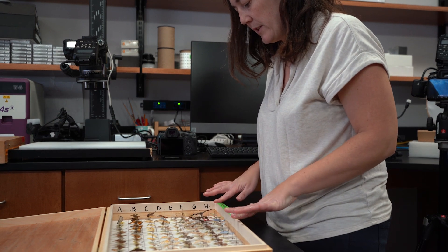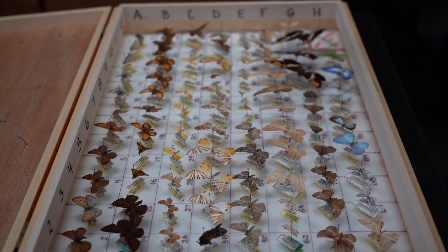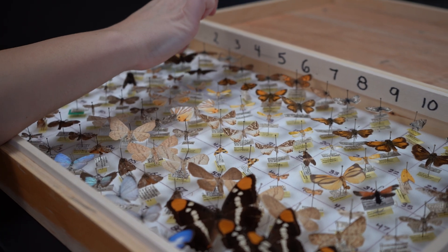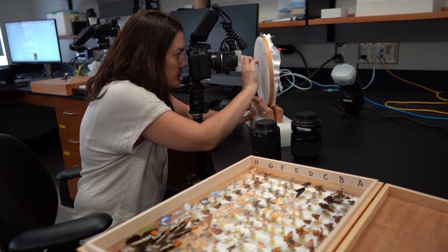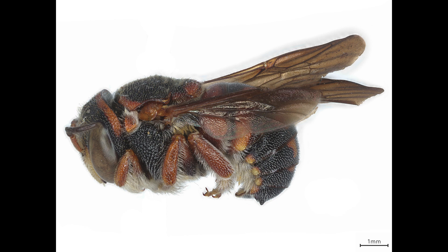Step 5, photographing the specimen. First, take an image of the array box number as a placeholder. Second, take a picture of the whole array box. This image is a reference to use after the container is disassembled. Make sure the label with the box's array number is in the image. Third, when you start imaging the specimens, always start with well A01 and go in array order. Fourth, decide the best orientation for the specimen — dorsal or lateral view. For specimens imaged dorsally, the anterior part of the specimen is placed on top of the image frame. For specimens imaged laterally, the anterior part of the specimen is placed on the left side of the image frame.